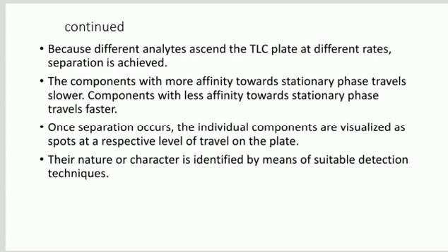Because different analytes ascend the TLC plate at different rates, separation is achieved. The components with more affinity towards the stationary phase travel slower. Components with less affinity towards the stationary phase travel faster.